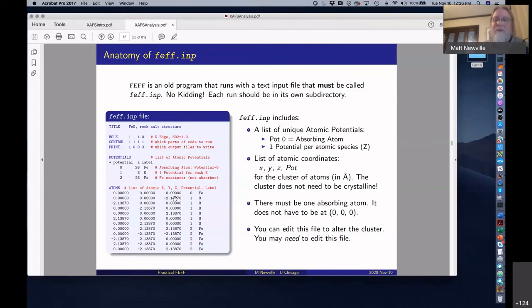When you do that, then you want to look into the polarization, because whether the polarization is in the plane or out of the plane makes an enormous difference. So you want to think about and include those effects when you do the measurement too. If you have a flat surface and you're looking at particles on that surface, in plane versus out of plane is very different. I hope that is a start to the answer to that complicated process.